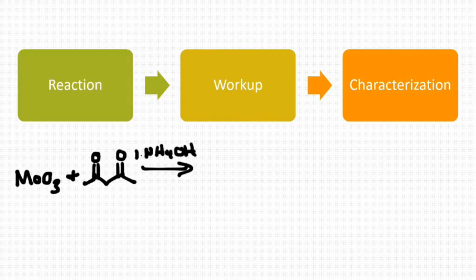And as you do that, I want to make sure that you write down the actual amounts of reagent that you weighed out, not just the handout amounts. And at the same time, I don't want you to spend all day at the balance making sure that the actual amounts match the handout amounts. So, get it close, write it down. And then you're going to react it for some period of time. Actually note how long it reacts. Not just that I set a timer, note when it starts, and then you can note when it finishes.